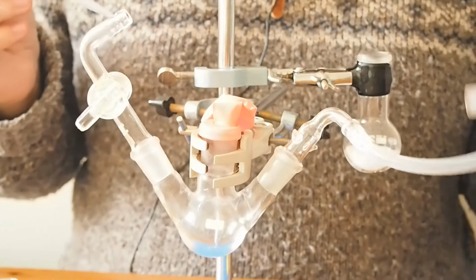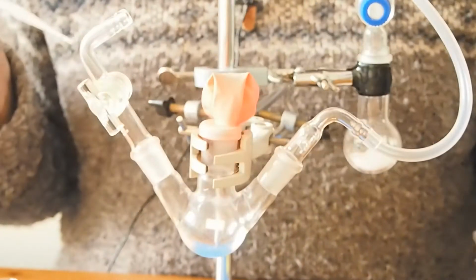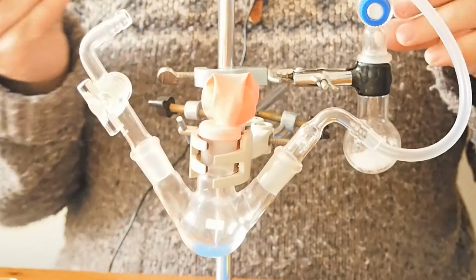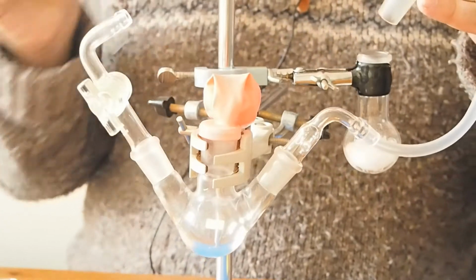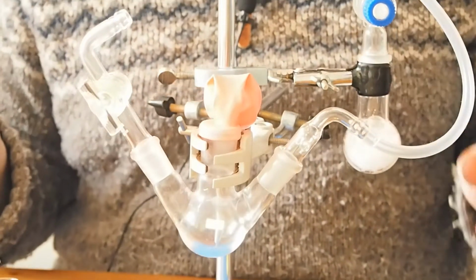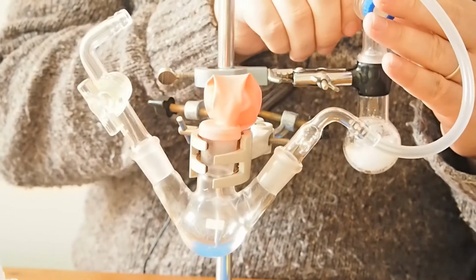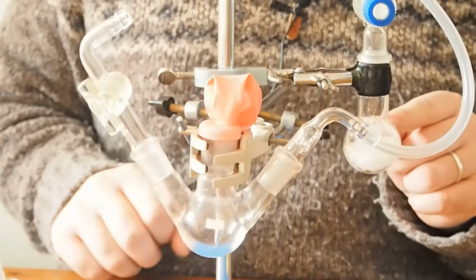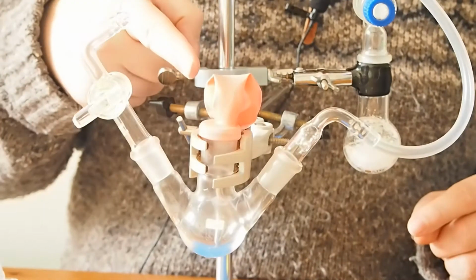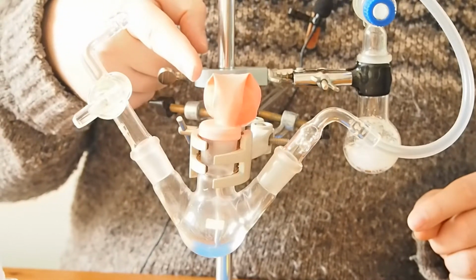See that fitting? So if we pop that on there, we want to open this tap so that we know it's flowing all the way through. I'm actually going to add a little bit more acetic acid to this. I can't hear the flow through here, but I know it must be flowing because it's bubbling here very vigorously. And if I close this tap, you can see the balloons moving because it's starting to fill up with carbon dioxide.